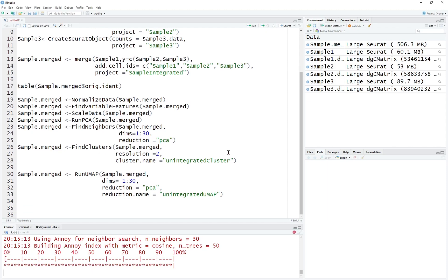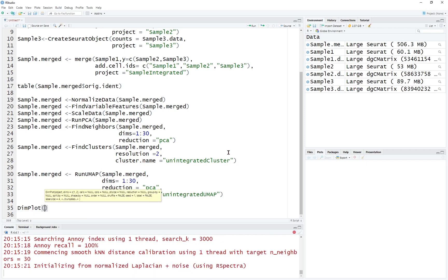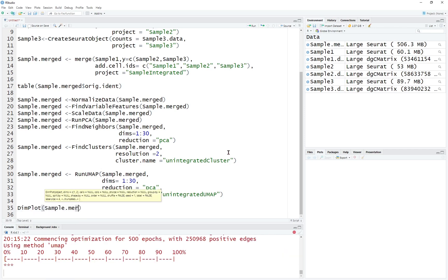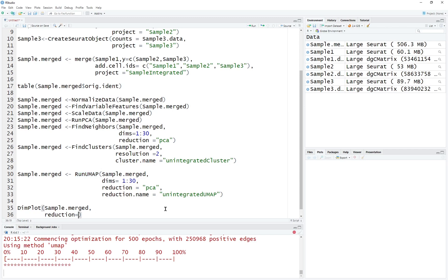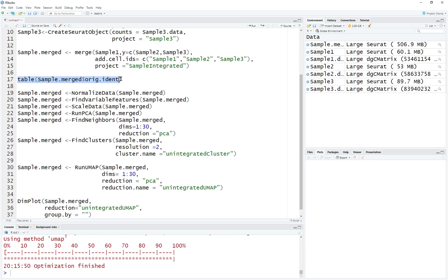Let's execute this. After doing everything, we can visualize the results. Visualization is called DimPlot — the input will be sample merged. The reduction will equal the UMAP we named — unintegrated UMAP. We're going to group the data by original identity. Original identity comes from the three samples — sample 1, 2, and 3 — so it will show each sample separately.